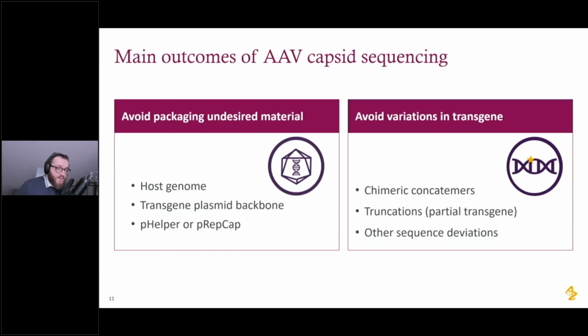What we want to avoid is packaging any helper or rep/cap plasmids, any plasmid backbone from the AAV plasmid, or any host genome from the packaging cell line. As Daniel mentioned previously, typically we use HEK for this.